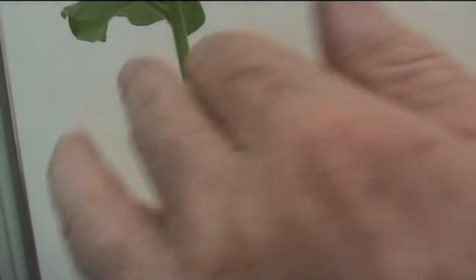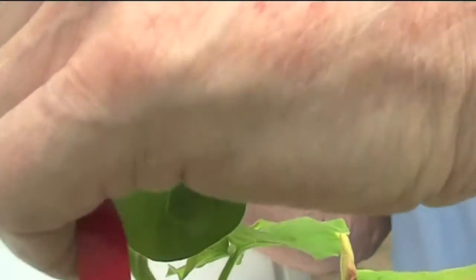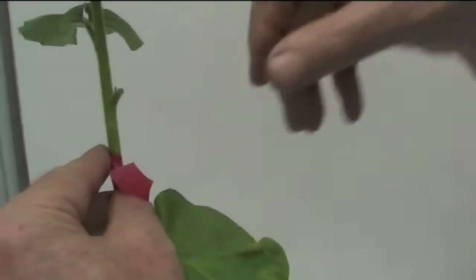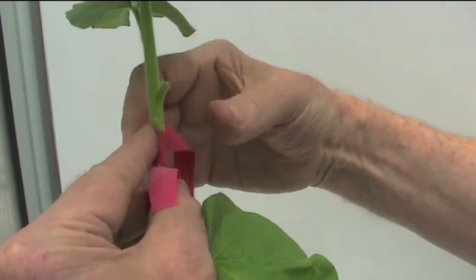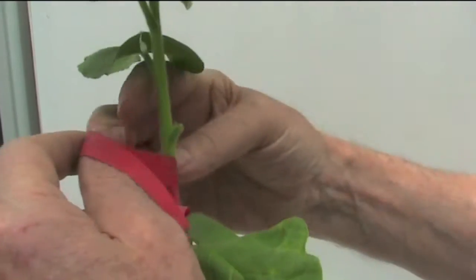Then I tie it on with a waterproof tape. We can use various kinds of tape — plastic tapes and rubber strip are very useful. We simply wrap the tape around the stem to cover the patch, so the patch is held firmly up against the vascular bundles and the cambium of the recipient plant.